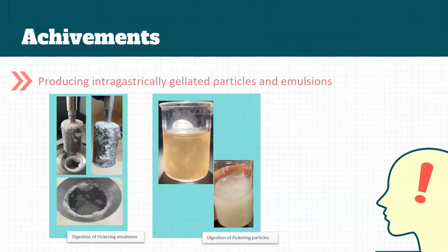Here are the cloudy gelated emulsions that you can see. We can determine the behavior of these. On the left-hand side, we can see the more particulated particles, where we see the asymmetric velocity profile. The other one is more like a general gelation, network-creating gelation type, and we see the plug flow for this type of emulsions. You can imagine maybe the situation.